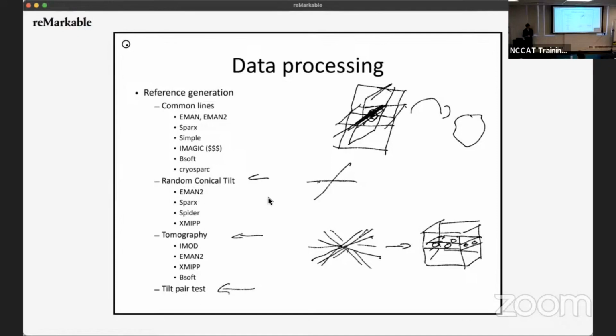Yeah, so I encourage anybody to look at that, because it also tells you the accuracy of your alignment. Am I accurate at plus minus 1 degree, or am I accurate plus minus 10 degrees? And that will tell a lot about the resolution you can achieve.